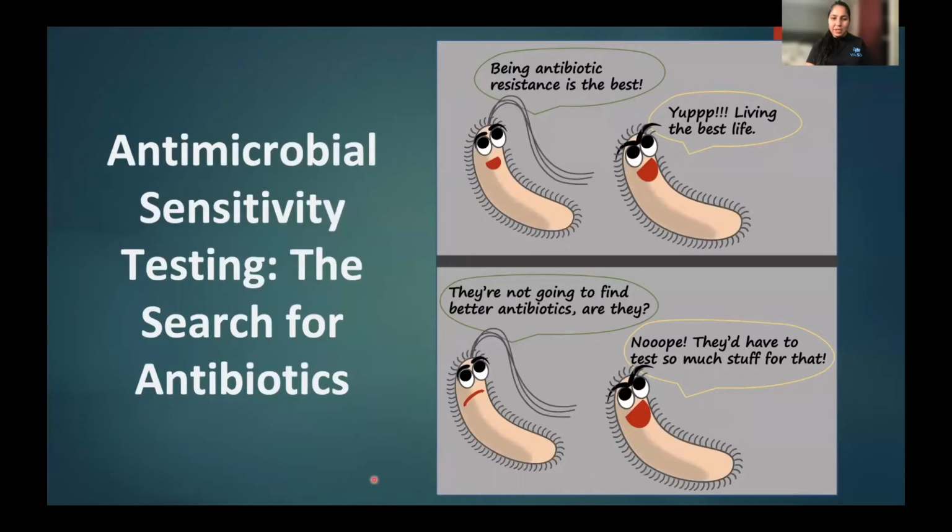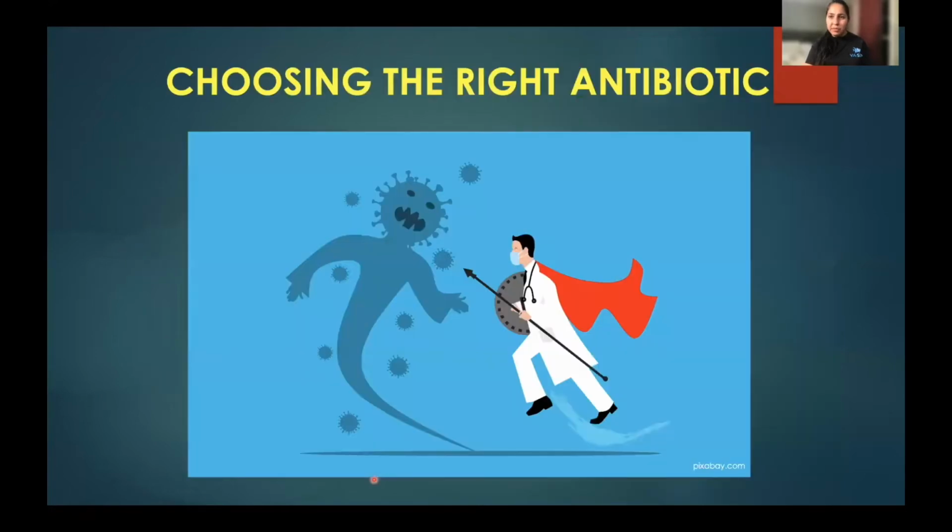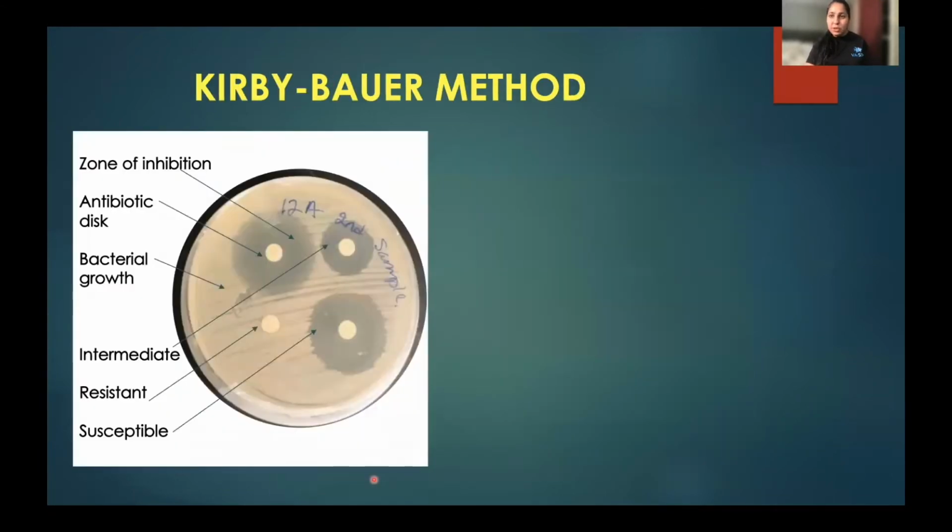My lesson plan teaches high school biology students how to determine antimicrobial sensitivity. Finding out the sensitivity of microbes towards antimicrobial compounds, such as antibiotics, is essential to establish an effective cure for a disease. One standard method to determine the antimicrobial sensitivity is the Kirby-Bauer method, where bacteria are grown on an agar plate in the presence of antibiotics, and the results look like those shown in this image.